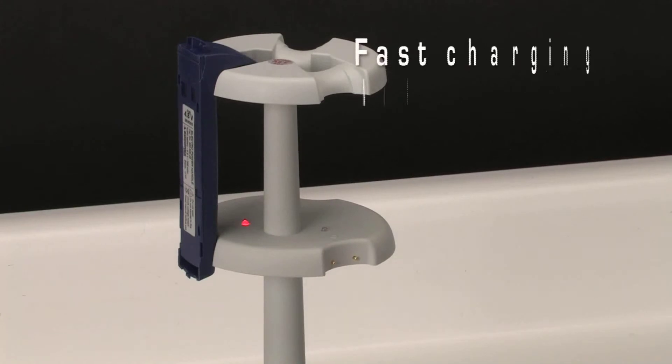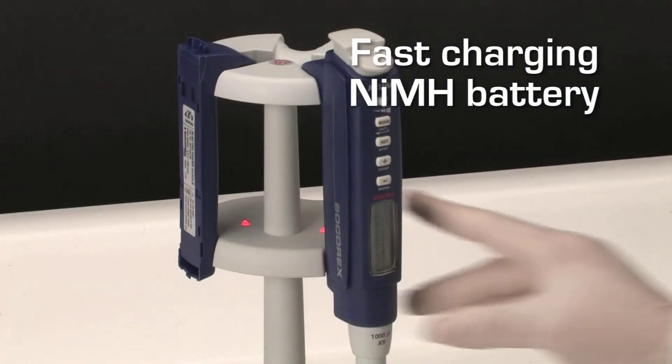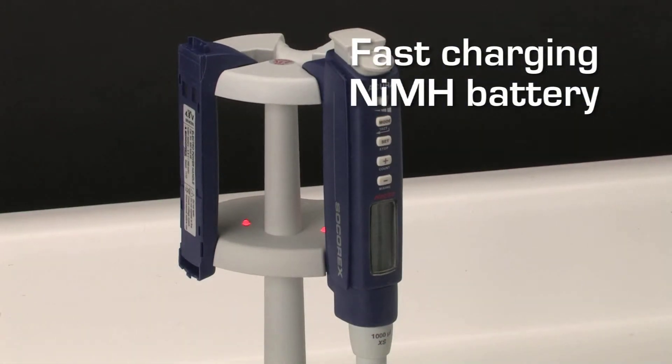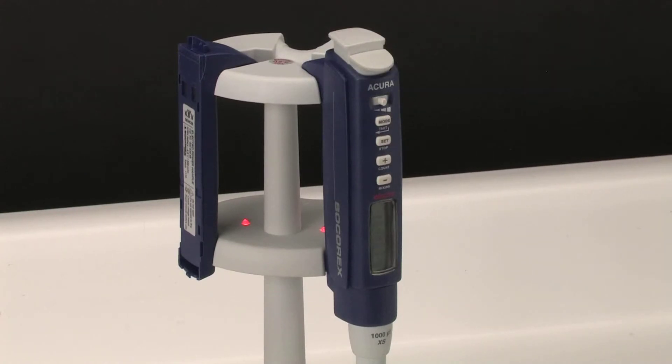Electro pipets can be charged two ways: charging the pipet together with the battery or just the battery by itself. When charging starts, the LED turns to red.